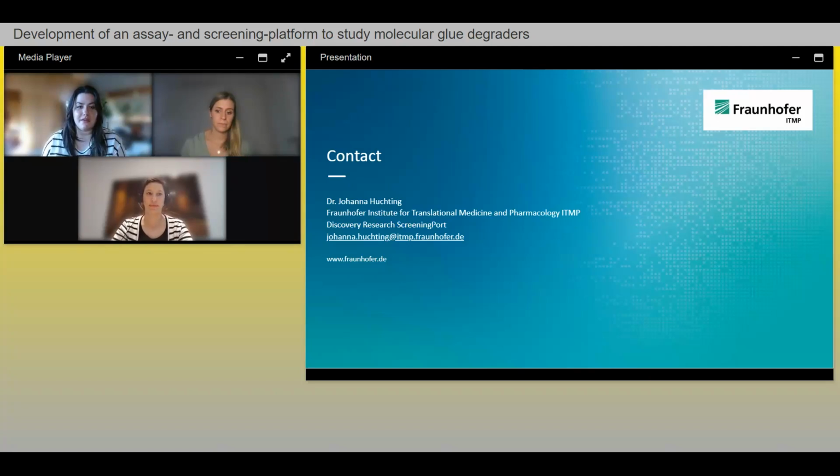Wonderful, thank you. All right, back over to you, Melanie. You shared that you run cell viability and HTRF on 2 separate plates. Would you be able to multiplex them as well? And are there alternative readouts for tracking cell viability in this setup? Thank you for this question. So I tried to multiplex the CellTiter-Blue and the HTRF. The CellTiter-Blue works in live cells. So you incubate the CellTiter-Blue on the cells, and after 3 hours you read it, and then you wash the cells with PBS and immediately process them for the HTRF. So that works.